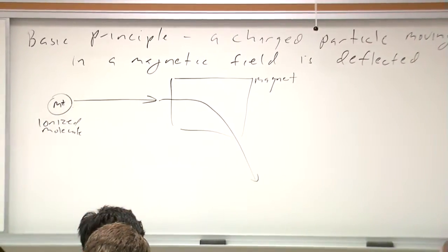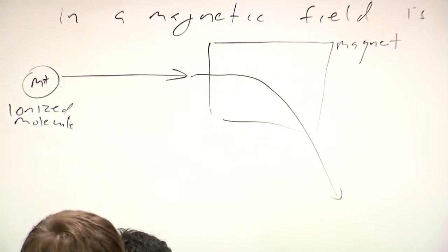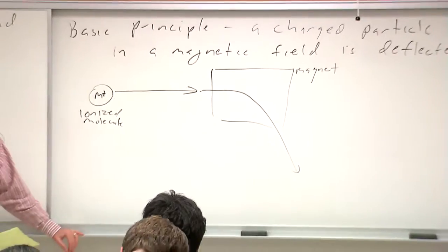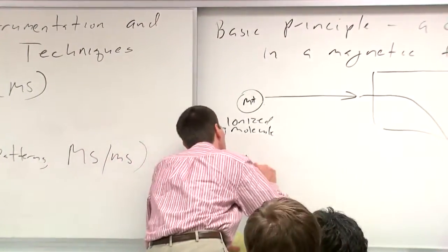You have a force on it, right? It's all that right-hand rule stuff from physics. The degree of deflection depends on the mass to charge ratio.